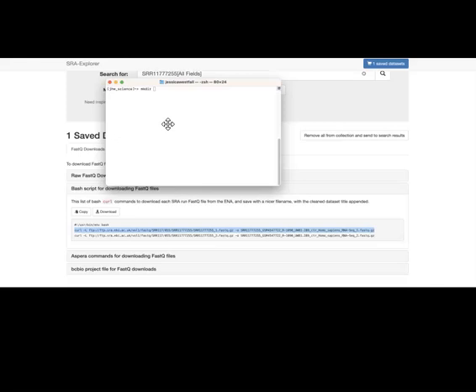Call this summer MBT. I'm going to go ahead and go into that folder right there. And let's go ahead and make another directory that I'm going to call raw.